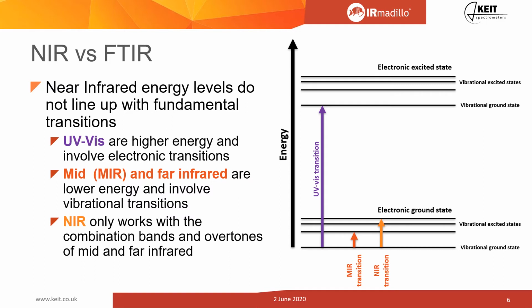Another obvious example is chlorophyll. Chlorophyll, bright green, and that's because the magnesium ion inside it has a lot of electrons that can fly around into the molecule itself, and that gives us our bright color. So this is the kind of technology you might want to use to look at things like color and strongly absorbing in the electronic part of the spectrum, such as chlorophyll.